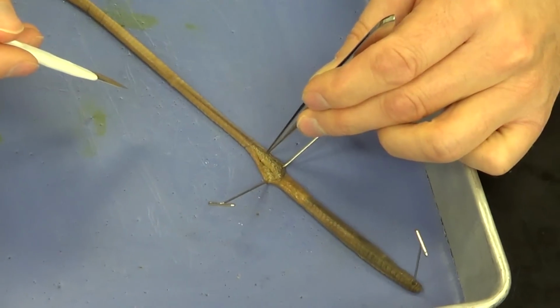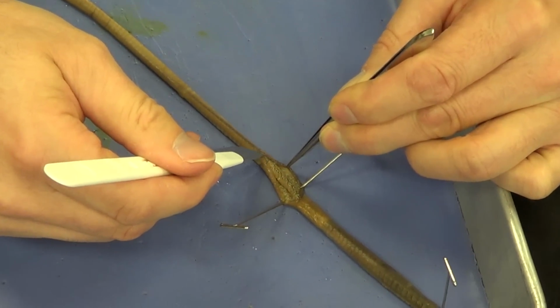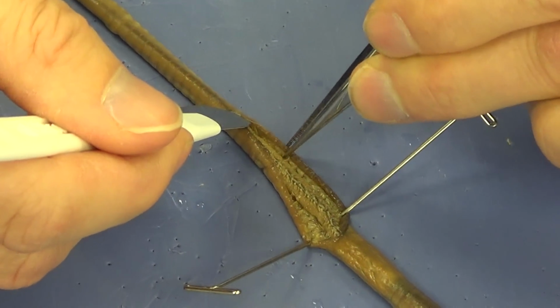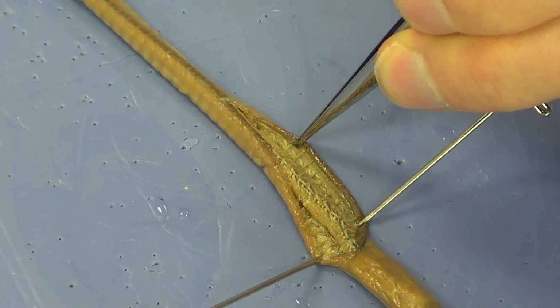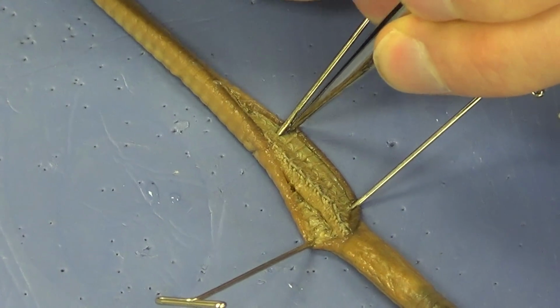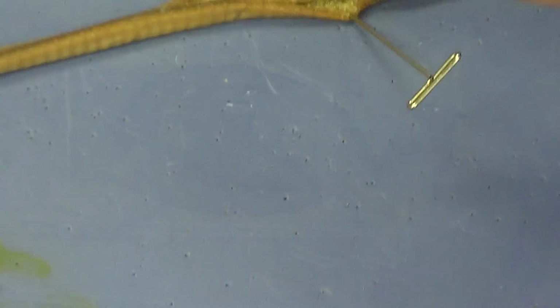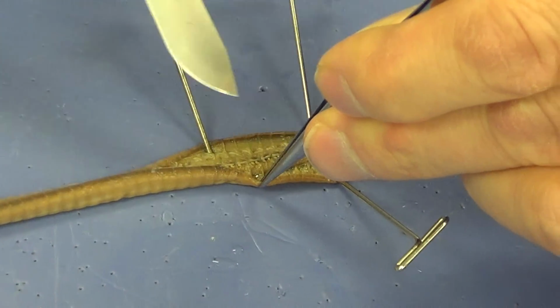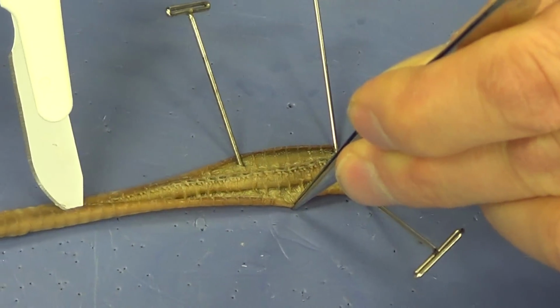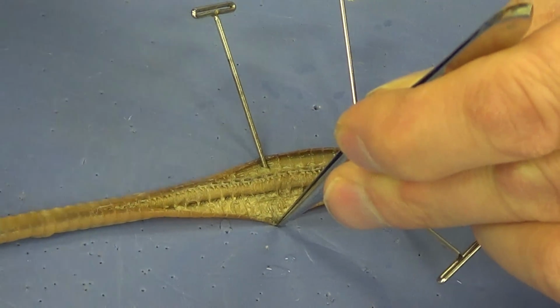Now I'm going to take the remaining skin and I'm going to pull it away just a little bit, and again I'm going to continue to cut very gently, maybe half an inch to an inch at a time. And I pull back the skin, or reflect the skin as we say in biology, and I put another pin in at about 30 degrees, and I just continue to work my way down towards the anus. So again, I'm going to go ahead and do the other side, working about a half an inch to an inch at a time.